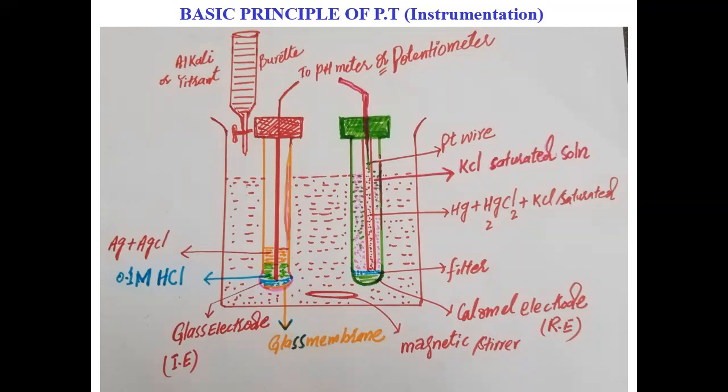Reference electrode potential remains constant throughout the reaction and is independent of the concentration of the analyzed solution. You can see in the diagram, this is a beaker in which the analyzed solution, whose concentration we have to determine.